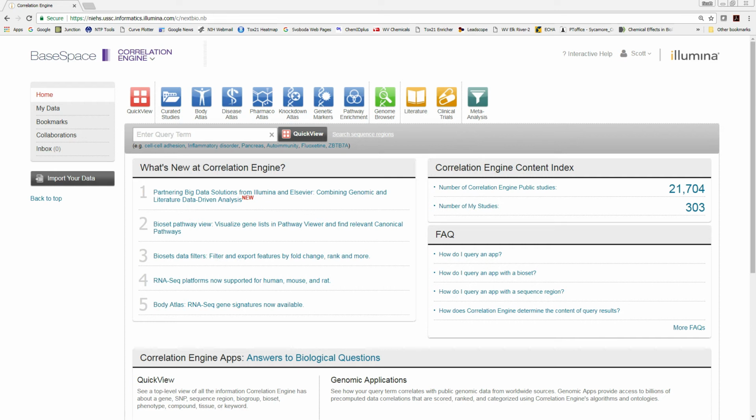So you can go across species, you can go across technologies. It's all linked up based on genes. So I can look at the correlation between my, say, rat gene expression data in liver and GWAS findings in humans. Again, all linked up through genes. And so let's go through just a quick overview here.